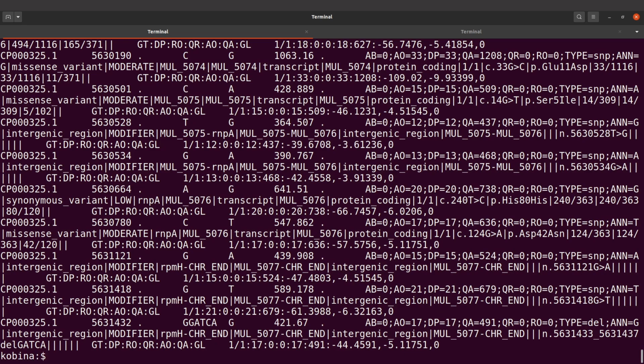Okay, so now everything is done. Now, if there were to be an issue, then you will have the information displayed somewhere here, or maybe in between here, or you will definitely find it. All right, but here everything is okay. So that is why the variant effect prediction has been done successfully, and there is no warning or error message. All right, but what we have here, everything was displayed for you.